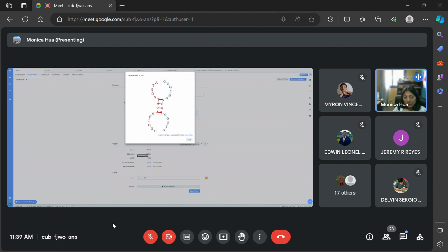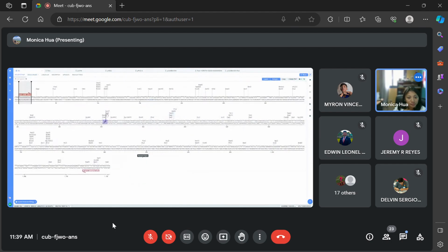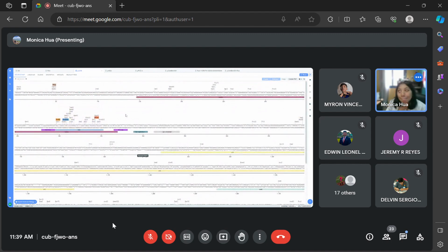Okay, we're at 11:39. Sheesh, just to make primers. Okay, so after making your primer, now what I want you to do is go to the plasmid that you have chosen, okay?